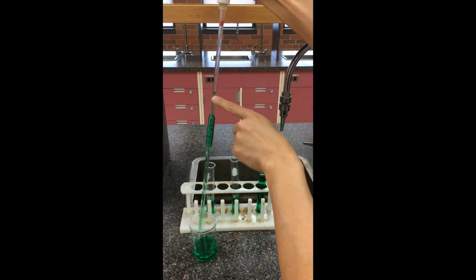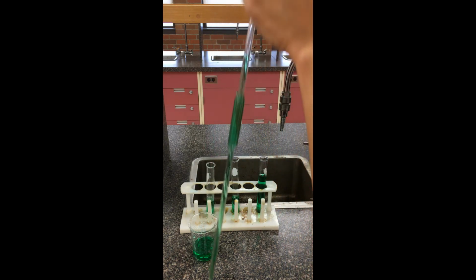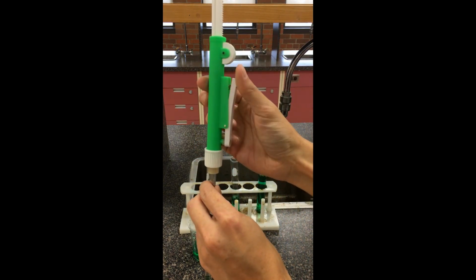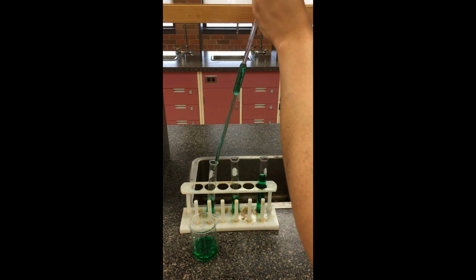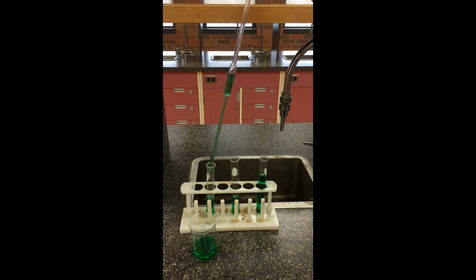Once I'm confident that, again, it's at the mark, I just press the button on the side. Again, I'll show you that button here. You just press this button here. I'm just going to dispense it back into the first test tube here. By pressing that button, it'll dispense that 10 milliliters that I had measured off, right? So there we go. That's the proper use of a pipette.